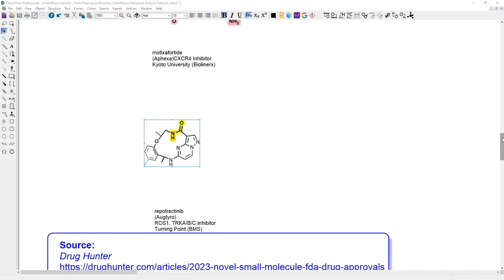You could also generate libraries using different types of generic structures, and you could either create them within ChemDraw or directly create an SD file that you can then use in other applications. In fact, we will use one of those files in a moment when we look at the bulk actions you can perform in ChemDraw for Excel.